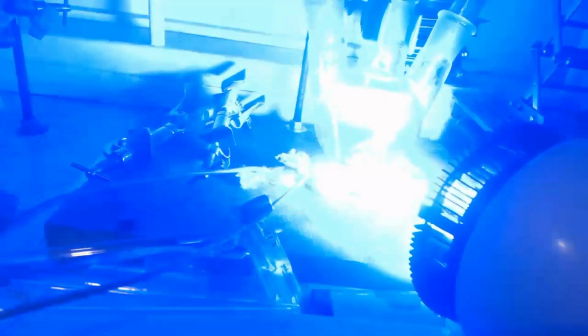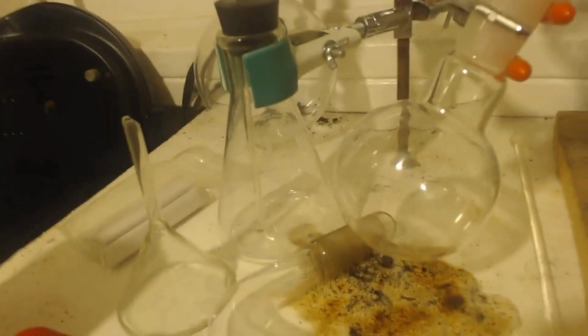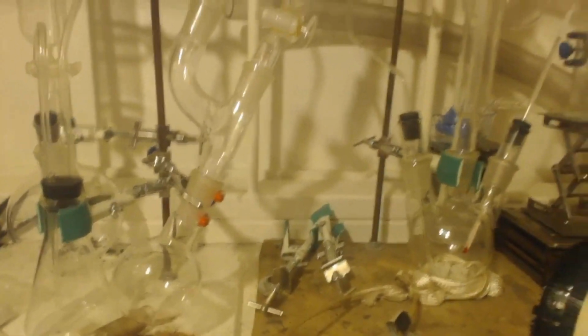Then I will turn on my blue light, and I will start my chlorine production. All this stuff that's the chlorine, making the chlorine, all before it gets to the pot, I'm going to have to put tin foil over all that so that the blue light doesn't make the chlorine radicals ahead of time. I mean, it wouldn't be that bad. I don't think it would react with the glass. I think it would just react with another chlorine molecule, but just in case, I'll cover it all up.